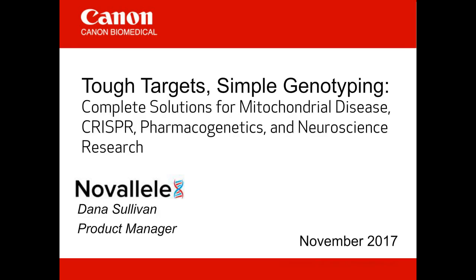Today, I'm excited to present on Tough Targets, Simple Genotyping, Complete Solutions for Mitochondrial Disease, CRISPR, Pharmacogenetics, and Neuroscience.